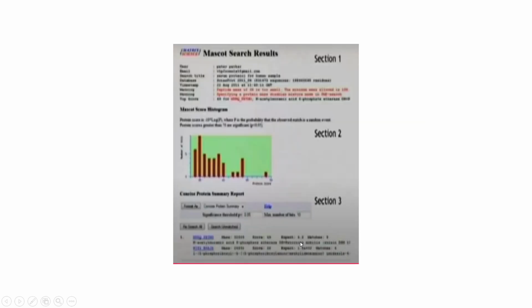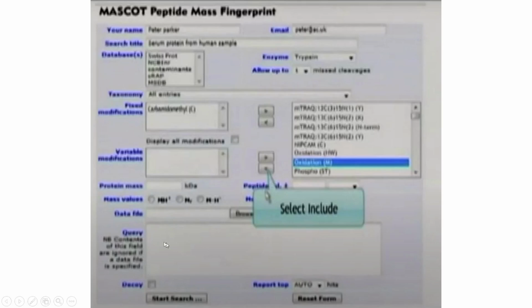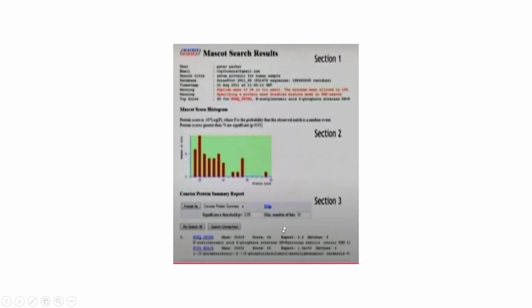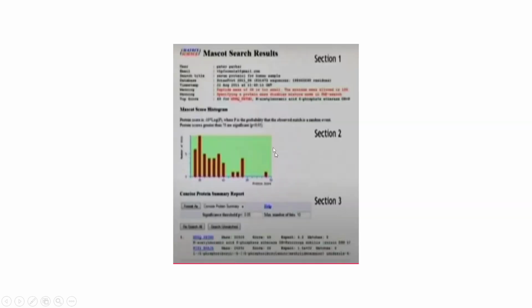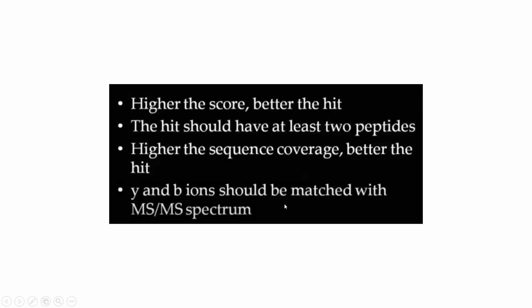So basically, a query sequence is also given. It will accordingly compare with that query sequence. So whatever you want to analyze, if that protein is present or not, you will add the sequence of that protein here in the query sequence, and it will try and compare the peptides which query will form. Like if a query protein sequence is digested by trypsin, what all peptides it will form, and if your sample analysis is giving you the same peptides or not. So that's what it will compare.